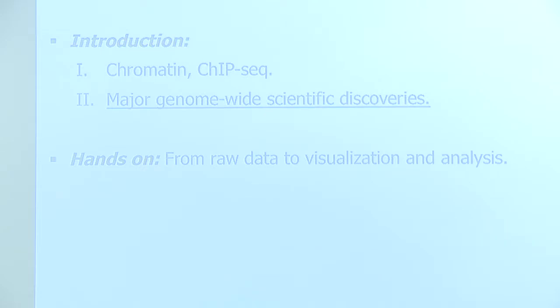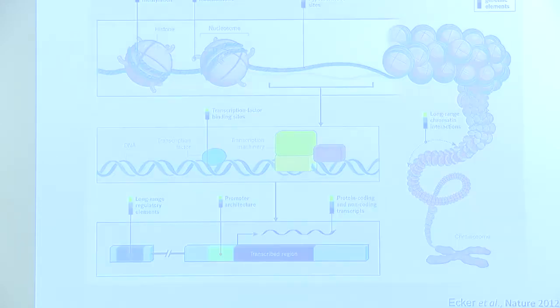And what I love, and what happens today, is that some of these efforts are overcome by tools such as GenePattern. So my point here is to show you what the data looks like, to give you an idea of how it is built, and some feeling of how to use it. I hope that you will get that from the hands-on analysis that we've built.